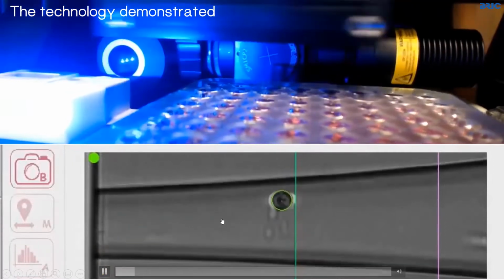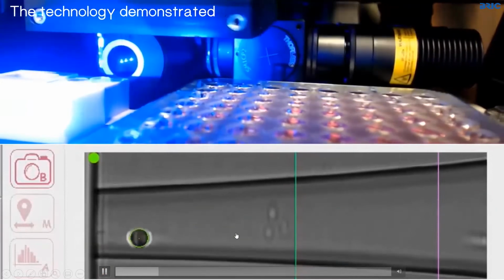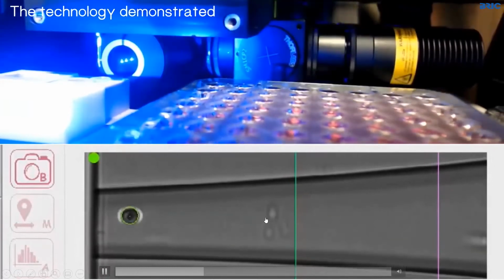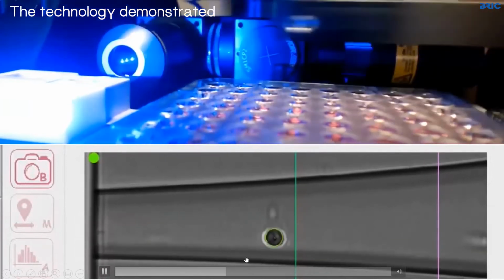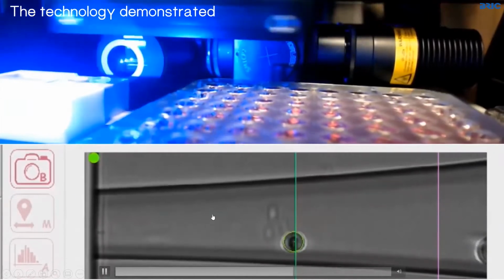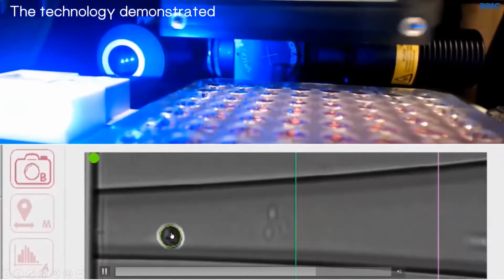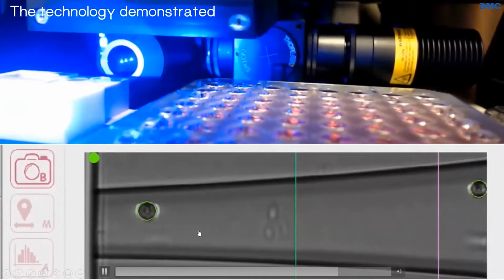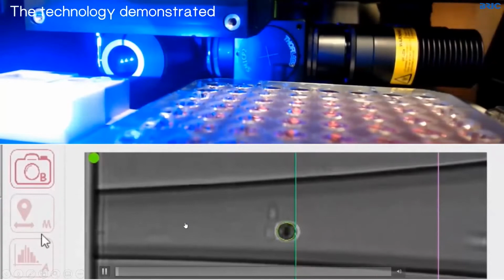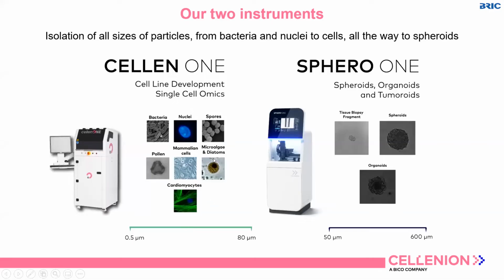So I have a single cell in the ejection zone, again, a single cell, single cell, single cell. Sometimes you will have maybe a doublet. You're going to see soon, and we will pause the image. Here we have a doublet, so we paused so that you have time to see it. So it's detected as a red circle, as you can see, outside of the fitting parameter. Again, some very large cells that were outside of the fitting parameter and not isolated. So as you can see, it's very quick and straightforward. So using this technology, we have developed 2 systems.